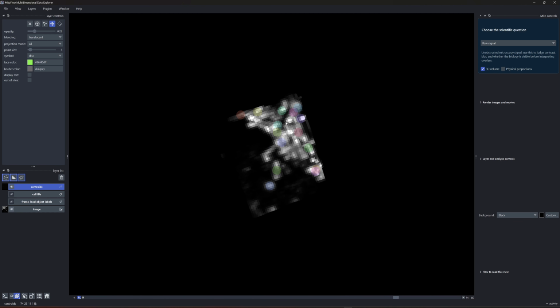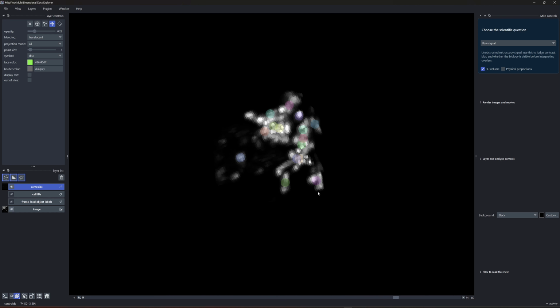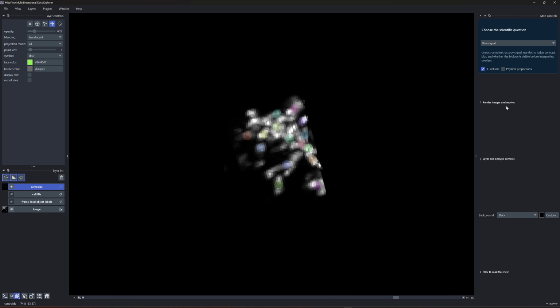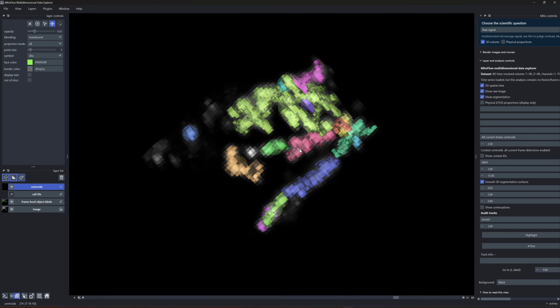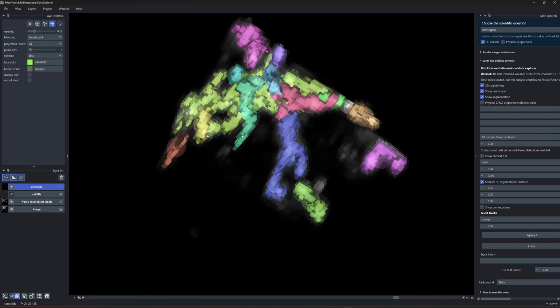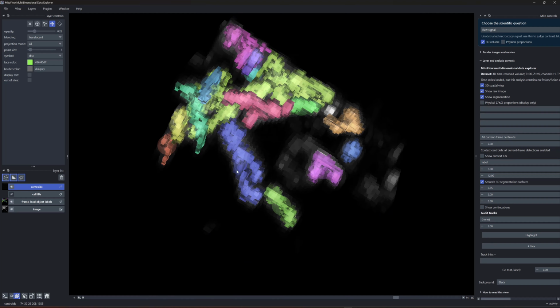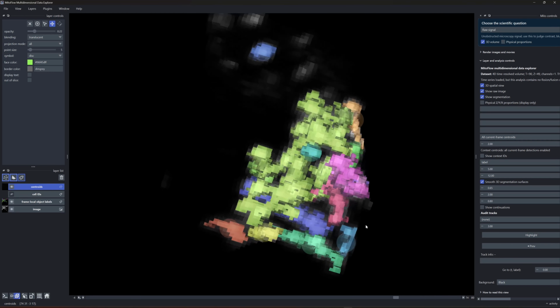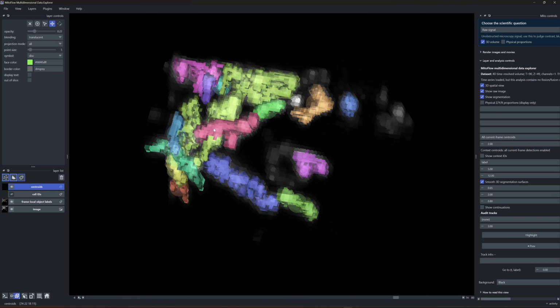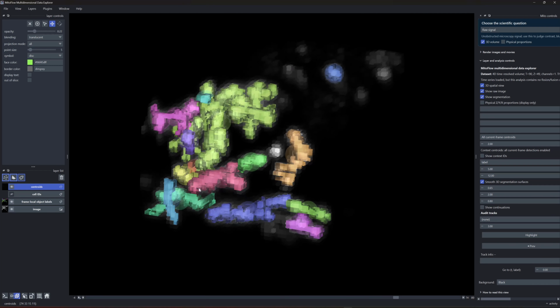I have these centroids drawn over there so that we can track individual mitochondria and see how they are moving around. But even more importantly, we want to be able to understand the dynamics of the mitochondria relative to each other and to their endpoints, but also the quantity of these mitochondria, and then how many times, for example, per cell or individually, the mitochondria are undergoing fission and fusion.